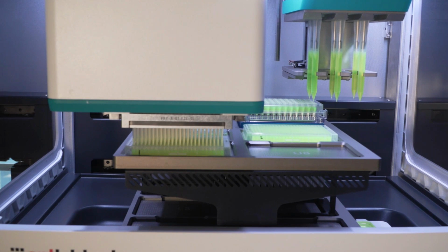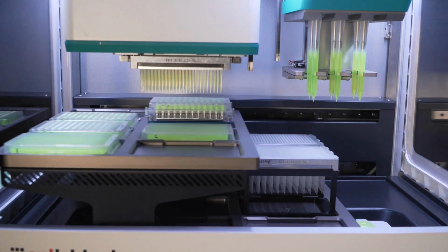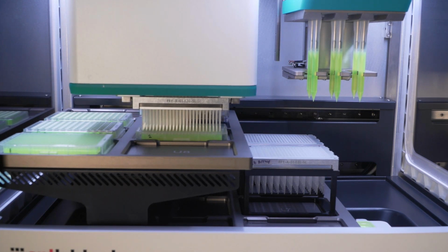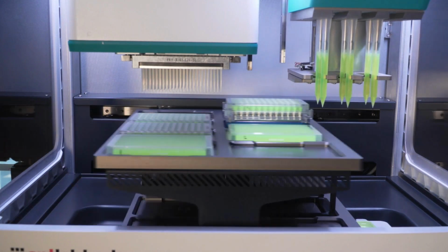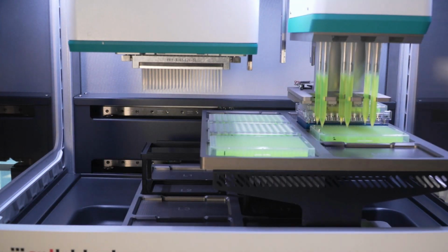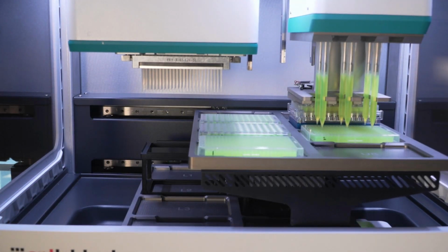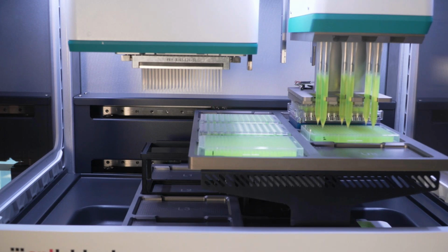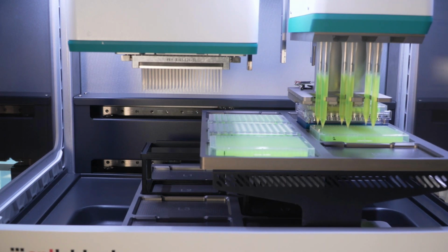And then it's going to dispense that across to a second plate, and then it's going to move across to dispense using the dispense heads. And we could be doing this with a mixture of 96 and 384 tips, moving from say 96 to 384 well plates. We could be using columns as well, so it's very, very flexible. Here you see it's just going across and dispensing with the 6 heads of the dispense head across this 384 well plate.